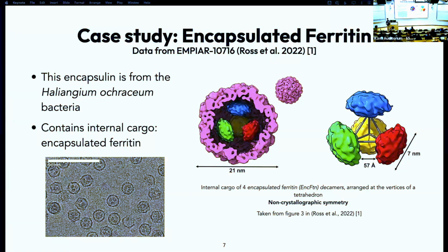At the end of the day, one of the themes you can take away from learning all of this stuff, and Rich said this at the beginning, is that cryo-EM is all about the images. Every single particle image only has so much signal in it. If you want to make distinctions like, is this subunit type A or type B, and the difference between those is only a few amino acids, you're asking whether a single individual particle image has enough signal to distinguish these two objects. And if those two objects are so similar that in the image with all the noise present there's absolutely no way to tell them apart, that's your answer right there.